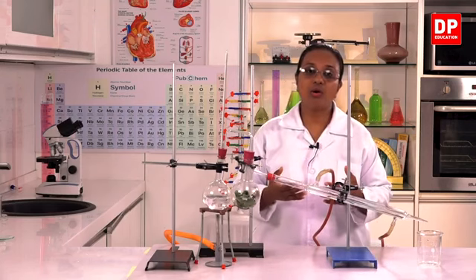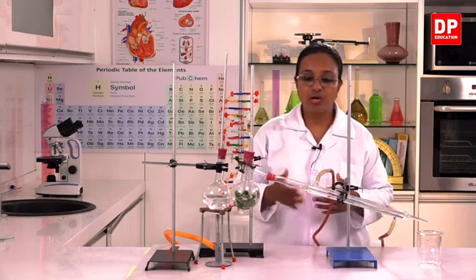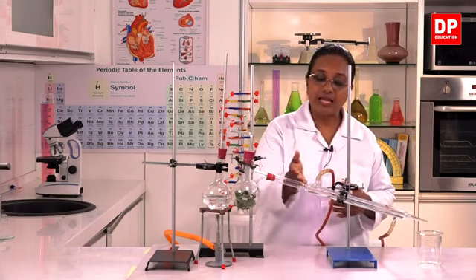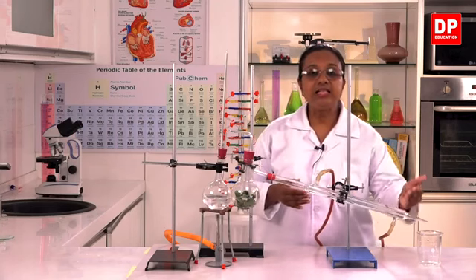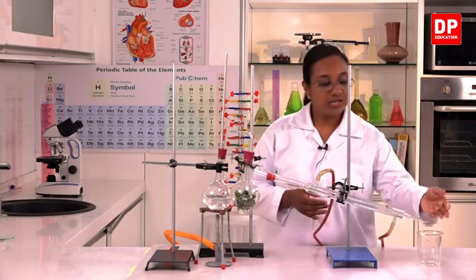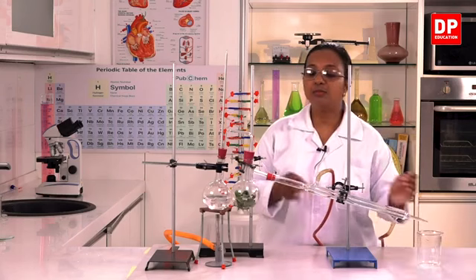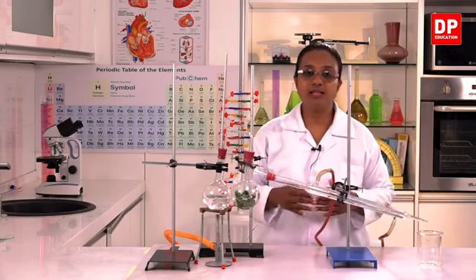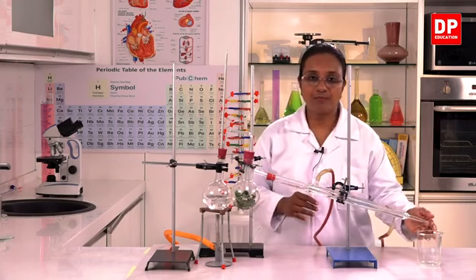That is cool, normal temperature water. So because of that cool water, the vapor that enters into the condenser will condense and the liquid will be obtained from the outlet. So here we will be collecting the oil that has been extracted from these cinnamon leaves. That will be the cinnamon oil.